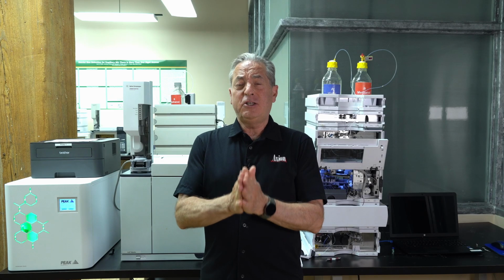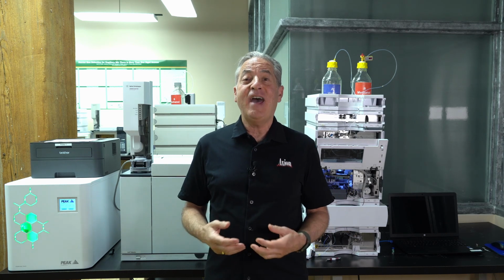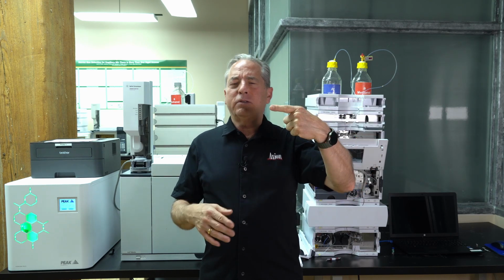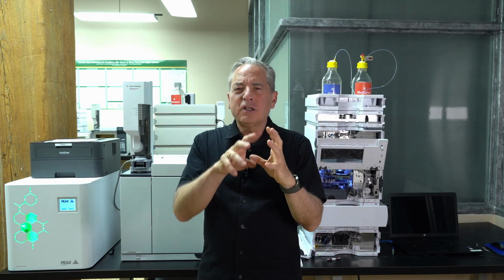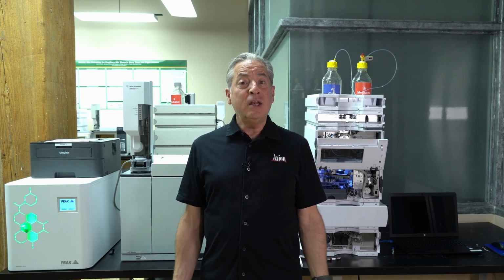I would say that in the GC, there's one area that comprises the vast majority of all the problems, and that's the inlet. Because in the inlet, we've got a lot of stuff going on. The sample's vaporizing, the helium enters, the split leaves, the column enters. So in all these little spots, we could have leaks, we could have adsorption, we could have different things going on. So my first piece of advice for preventative maintenance on a GC: change out all the parts of the inlet.